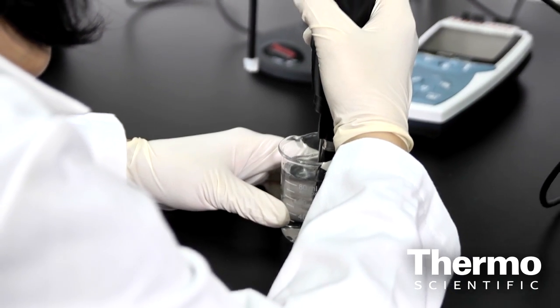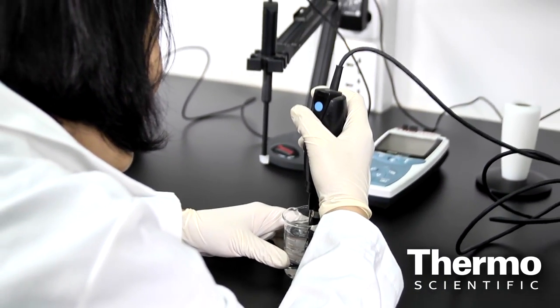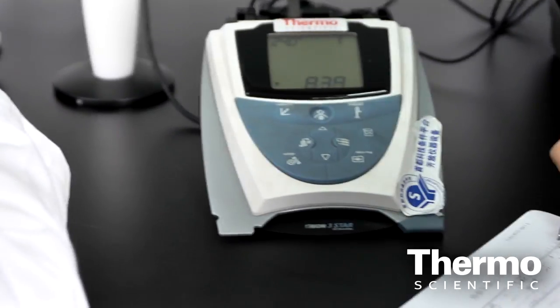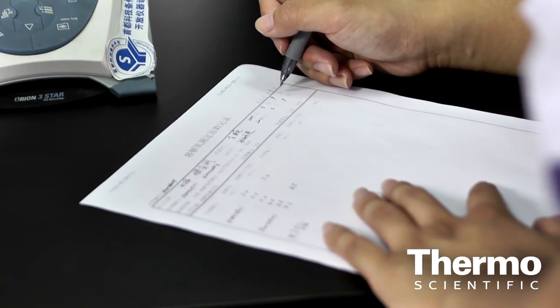Let's start with inspection of fluoride ions in air. Through the procedures of sampling, concentrating, acid cleaning and digestion, and then by applying the Thermoscientific fluoride ion selective electrode and its iron meter, we can accurately measure the concentration of fluoride ions in the air. This method is not only convenient, accurate and effective, but also complies with applicable national regulations in this regard.